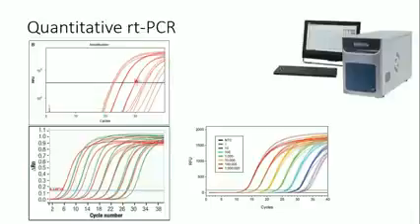So you're seeing multiple curves because, as I told you, we can apply real-time PCR for several samples at one time. We can apply it in 96-well plates, and so we get several amplification curves. You are seeing here three overlapping curves, because sometimes we apply the same sample 3 or 4 times, like in a triplicate, to ensure the results.